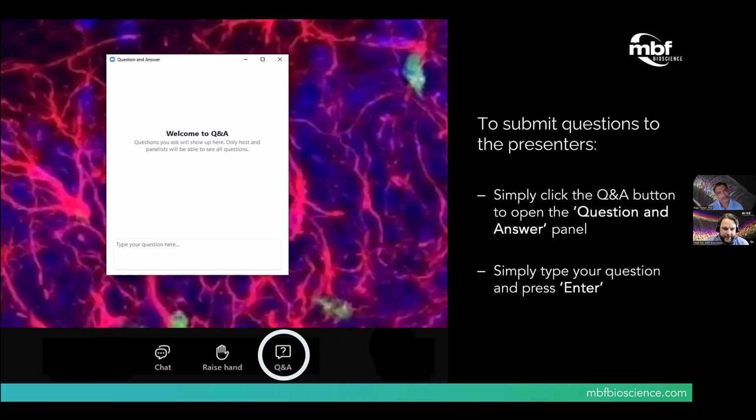I see another question here about whether the system can accommodate different objectives and whether they can be interchanged by the users. Yes, it can. We can do customization in terms of the illumination objectives. We can increase the magnification that's offered with the base package, which actually gives you a thinner light sheet. So that can be changed out as well as the detection objectives. For detection, we offer a 10x objective as well as a 5x objective. Those can be changed by the users.